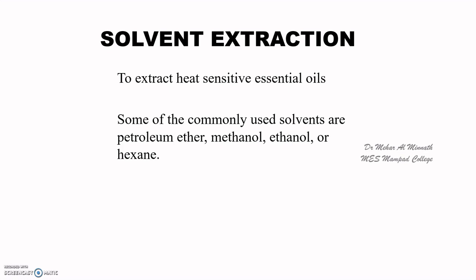So instead of the volatile solvents which we use, nowadays we can go for supercritical carbon dioxide, which will dissolve the essential oils in it. So when you are using supercritical carbon dioxide, we are not using volatile solvents, and we are going the green way. And the problem is when you use supercritical carbon dioxide, it is a bit more expensive. No other problem with this. The rest is, this is a very good method.